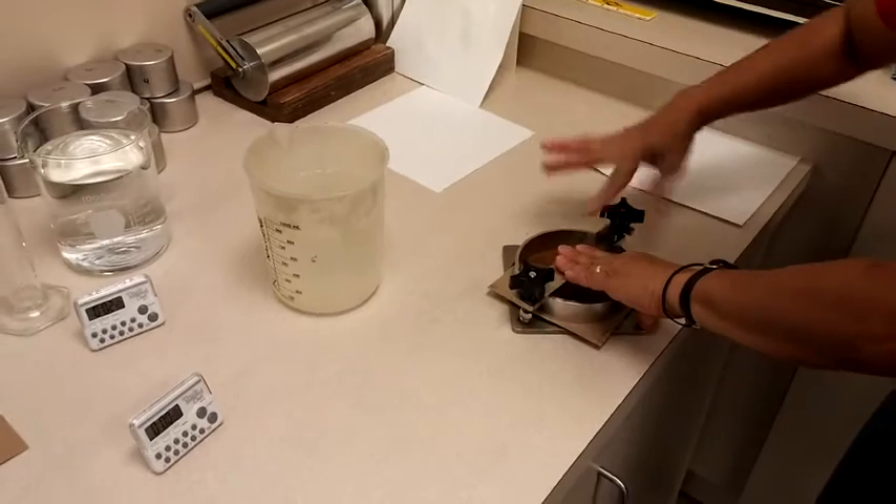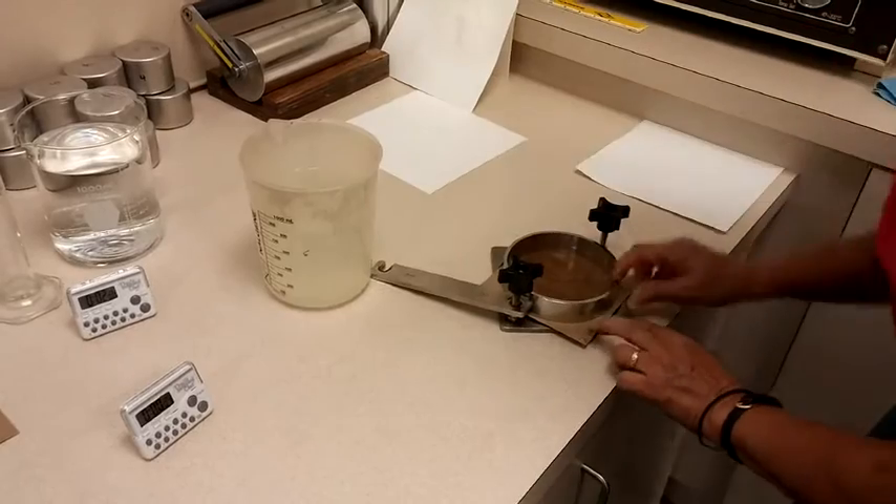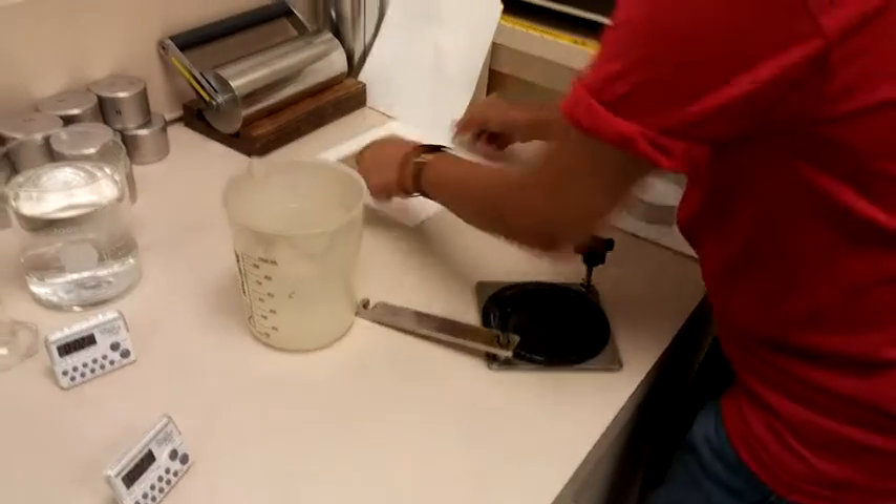The values are reported in grams absorbed per 100 square centimeters. Greater water resistance will result in lower WaterCob values.